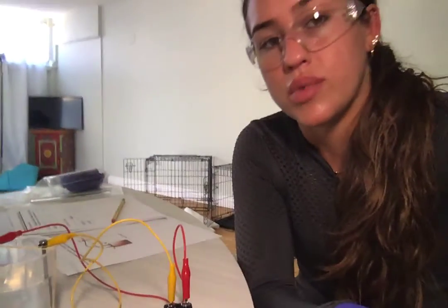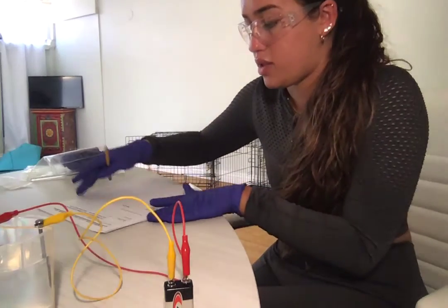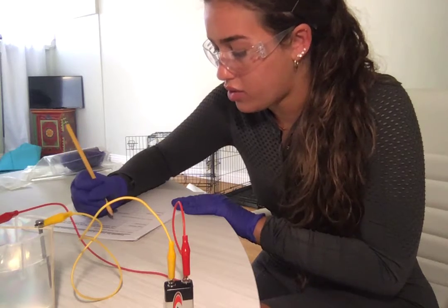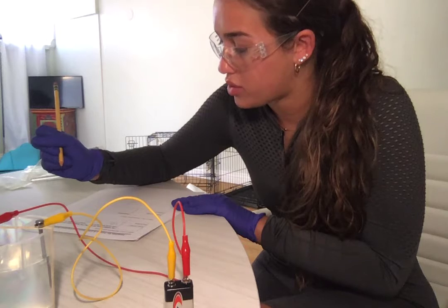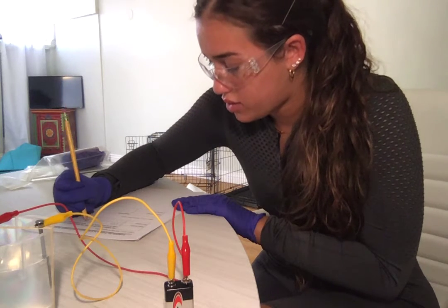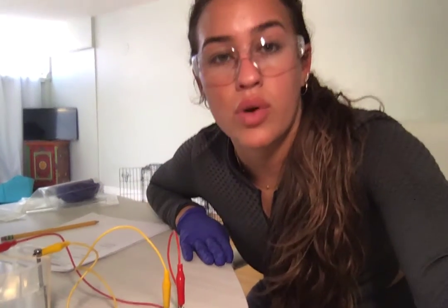I'm going to record in my table — this is for the sugar solution. Do bubbles come off near the nail? No. Do bubbles come off near the steel screw? Yes. And now I'm going to do the same thing for the salt solution.